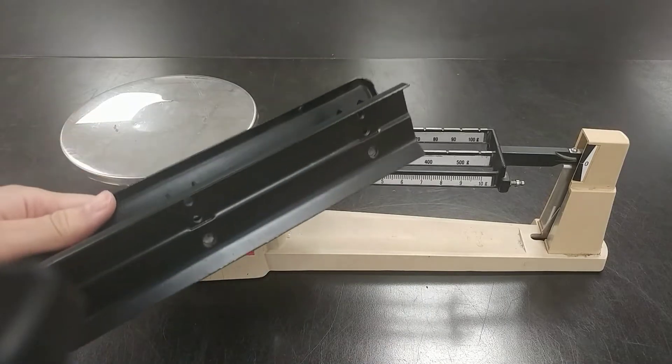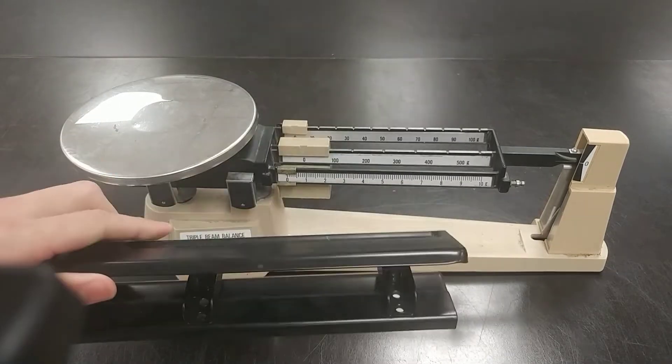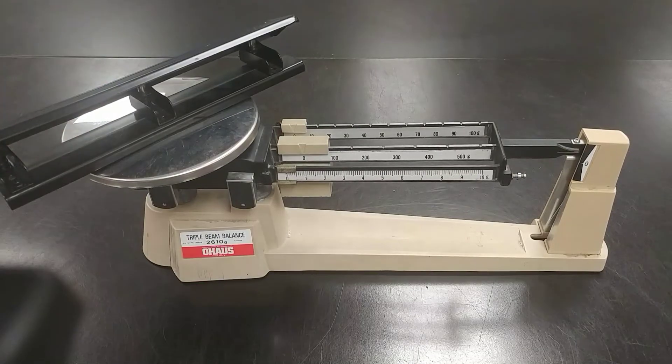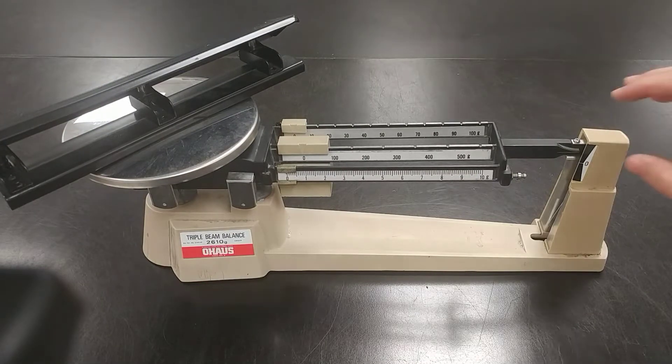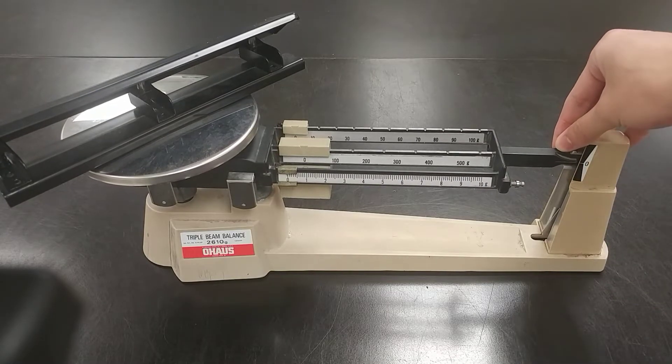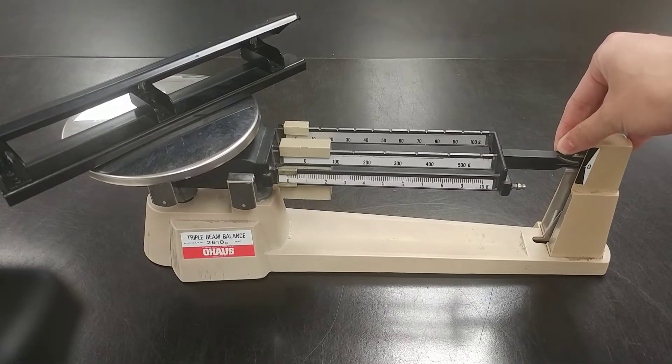We're going to use this balance to measure the mass of a hole puncher today. To begin, we're going to place the hole puncher onto the plate. Our goal is to get this to be exactly in line with zero in order to find the mass.